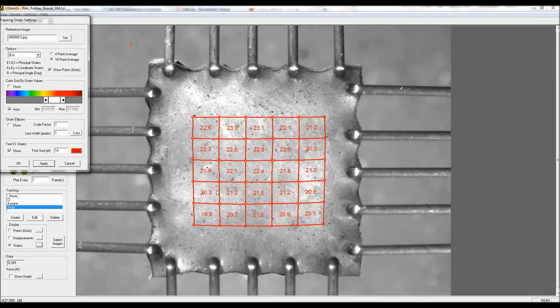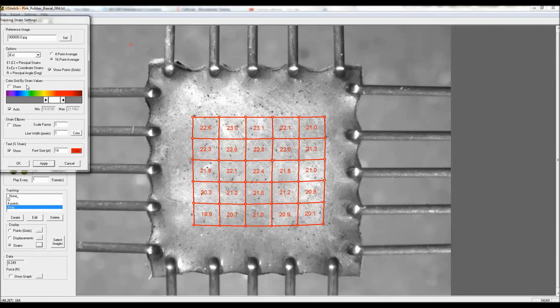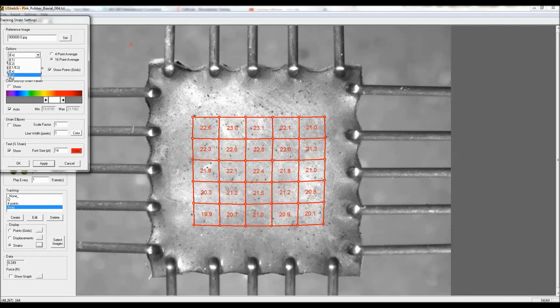And we can see here we do in fact have about 20% strain with some variation, and we can also look at the Y strain just to verify that it was the same.